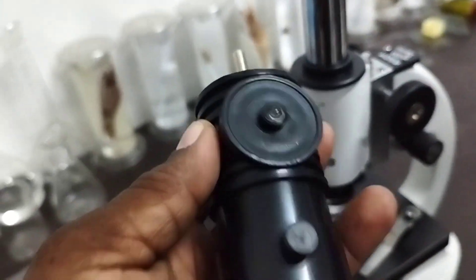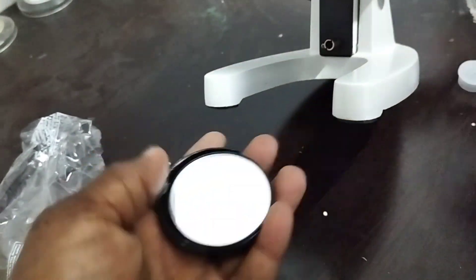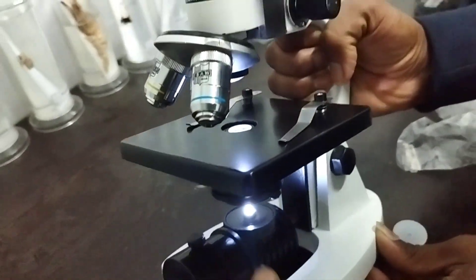This is the artificial light source. They have given a reflector, but we are removing the reflector and will use the artificial light source instead. Battery is already included — let's check. Battery included! There is a volume knob so you can increase or reduce the brightness. There is also an on/off switch. Super! We are attaching it here — okay, it's attached. Light is already on.